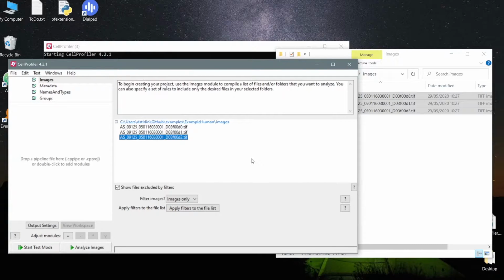And one of the key goals in the four input modules is to try and change a long list of files into a series of sets of images matched to each other. So in this case, rather than having 3 sets of images to run, we actually have a single set with 3 channels. And that's what we really need to use the rest of the input modules for.